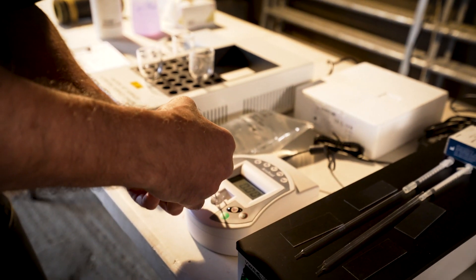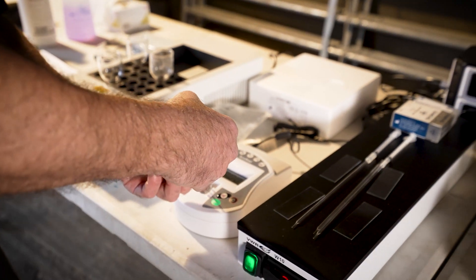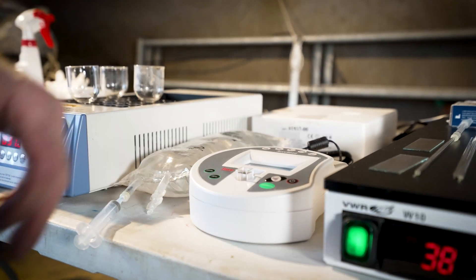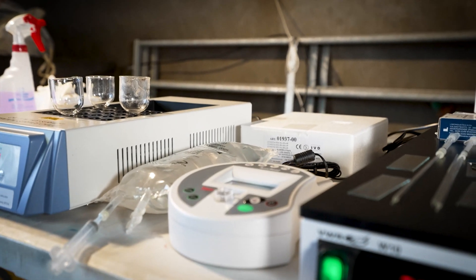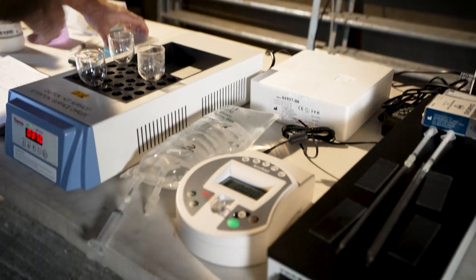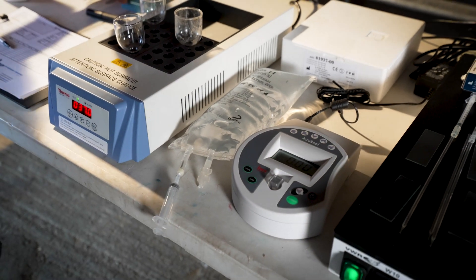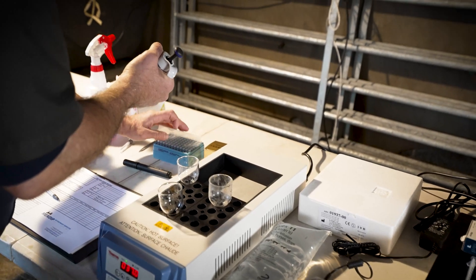First of all, I put in the normal saline, then we'll zero it to make sure that we don't get any false readings. The next step would be to take a small amount of the sample.